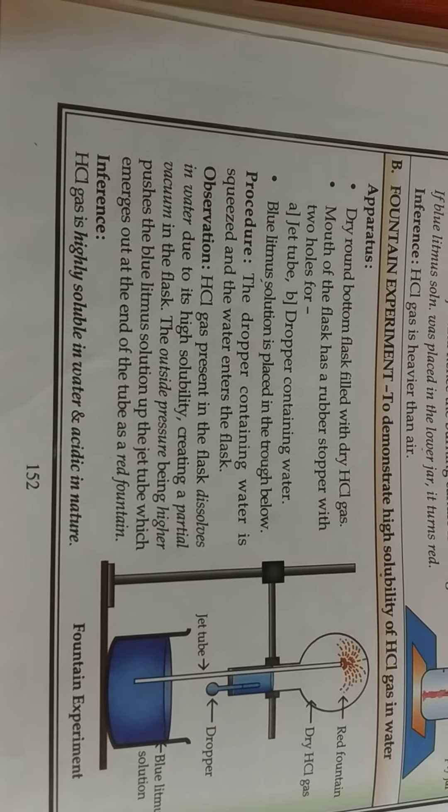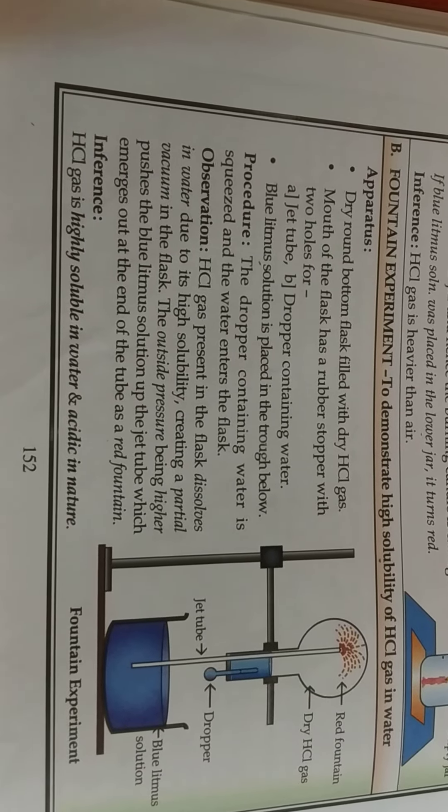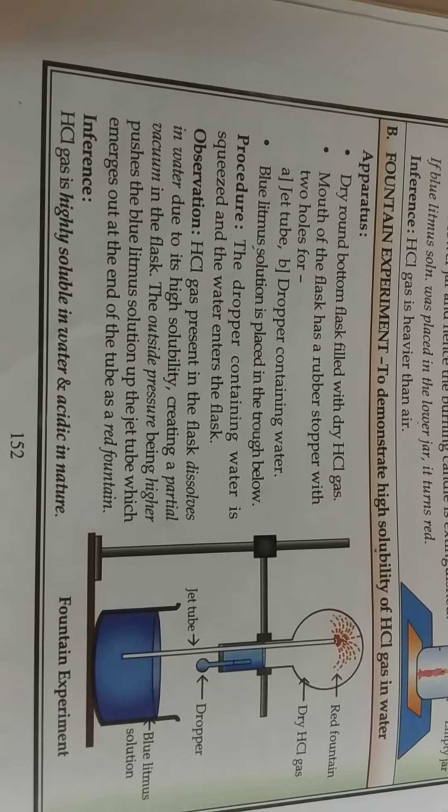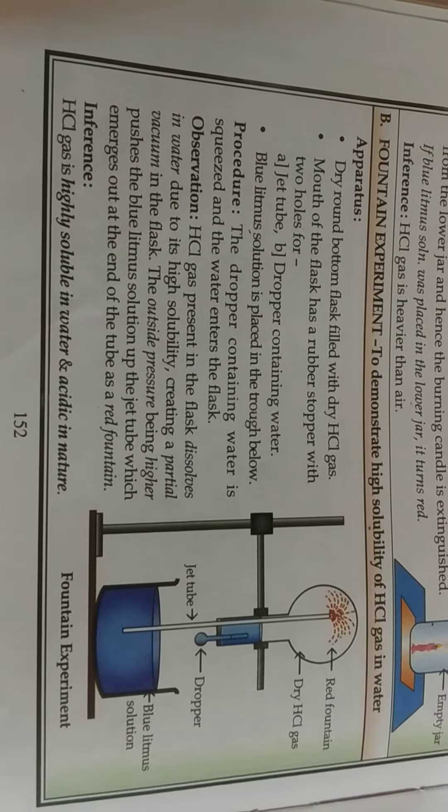Because the blue litmus solution and dry HCl gas come in contact, the reaction will take place and we will see a red fountain in the round bottom flask.